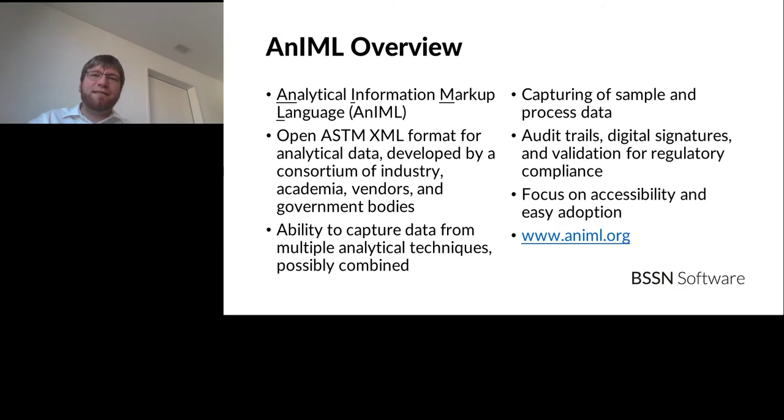And in particular, LIMS vendors or instrument vendors, they just looked at it. They looked at a couple of examples, and then it was really easy to pick up and to get going. And if a standard does that, and if it has a really low barrier of entry, then it can be successful. And especially for data formats, the accessibility is very important because, if we remember, data is the most important asset that we generate out of lab experimentation, right? It's the results that we care about. So making them accessible, that's also part of the mission here.